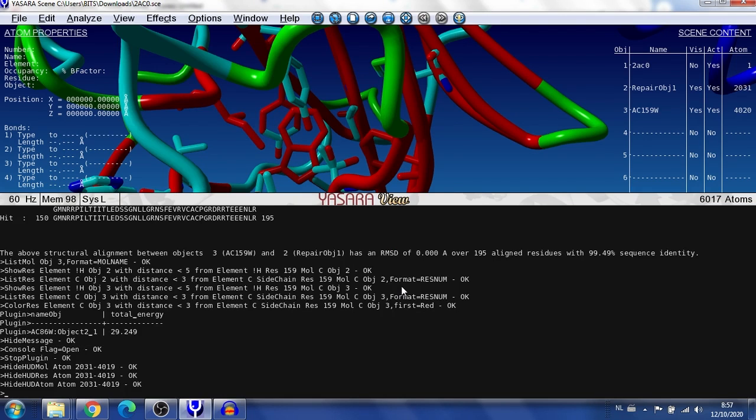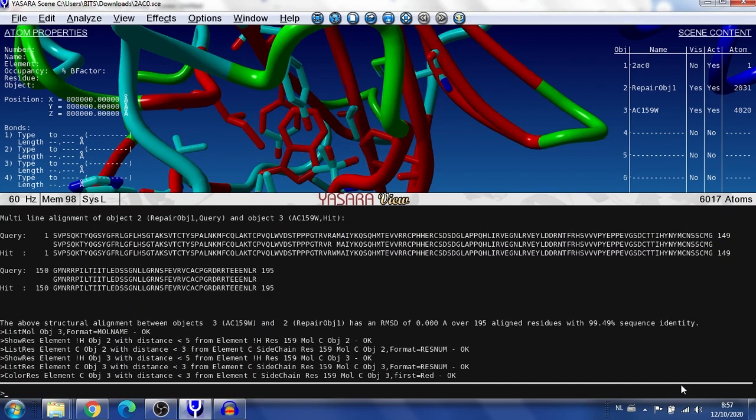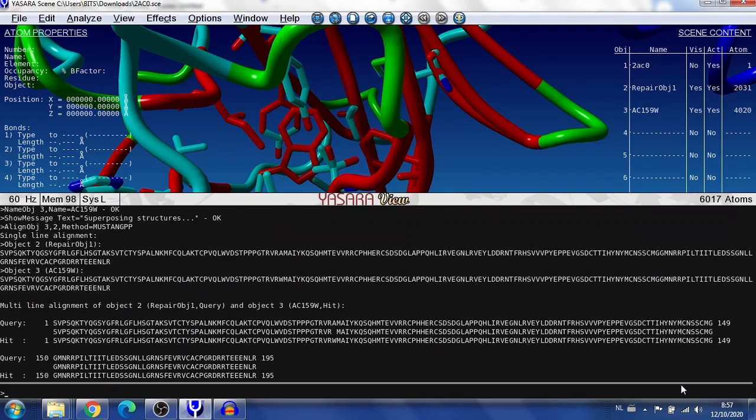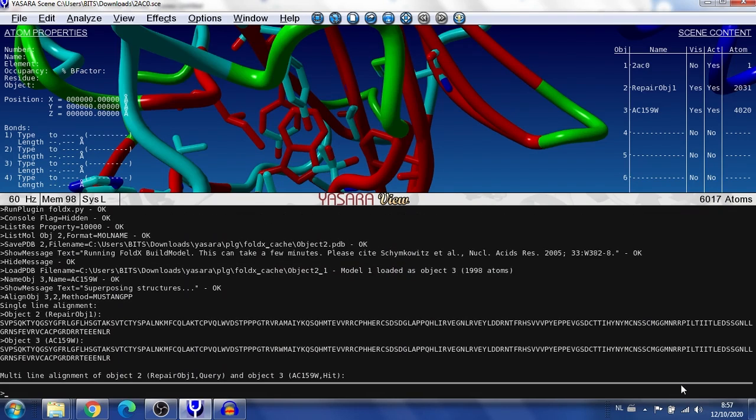So I open with a space, typing 2 times, this window to have it largest. So again here, if I scroll up a little bit, I hope I can do this. Yes, I can do this. So this is Control: I press the Control key and then arrow up, so then I can move a little bit in this interface. So let's see.